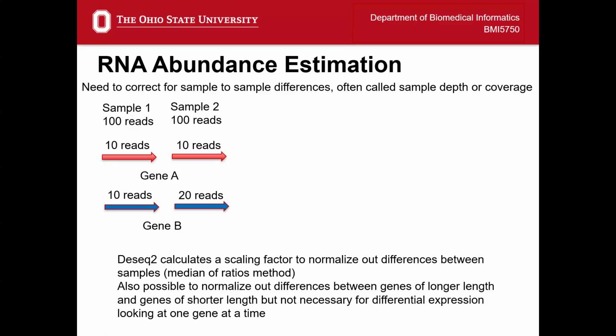So look specifically for GEO projects that have counts, and there will be a link to download the counts on that web page. It's usually down at the bottom with the supplementary information. But you also have to get the phenotype information, which, if they make it easy, they'll share as a sample table too.